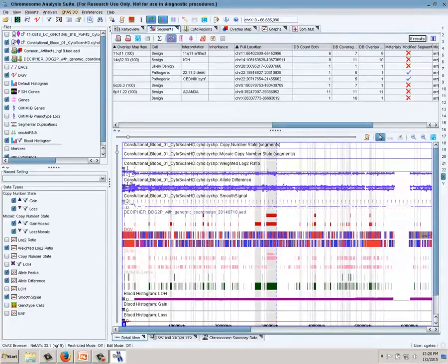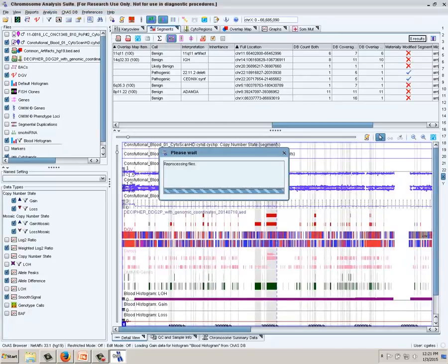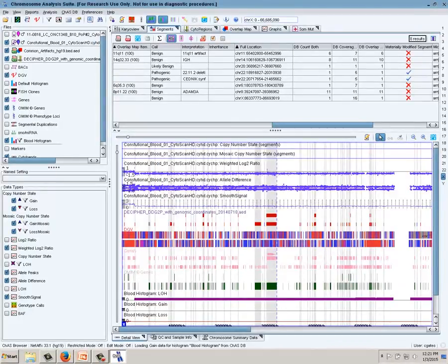For larger databases, it takes a few seconds, up to a minute or so, for the histograms to regenerate. Rather than have to wait for that each time, at this point it's a manual step, but you can just come up here and say refresh my ChAS DB data. It's fairly quick on my laptop, as I have only about 30 samples in my database, but as the database gets bigger, it will take a little bit longer for those to regenerate, so that's done manually at this point.